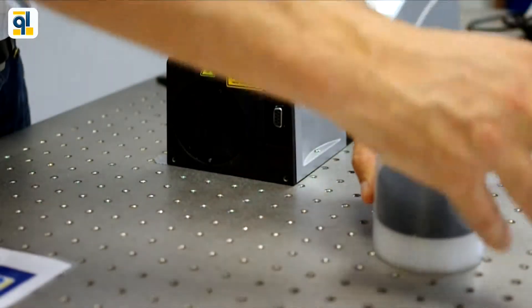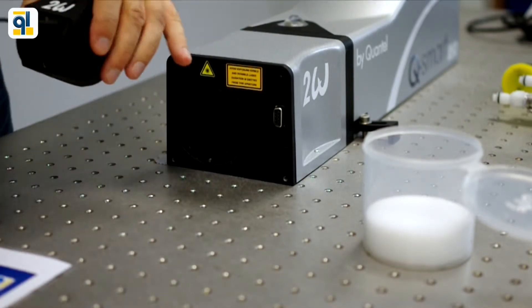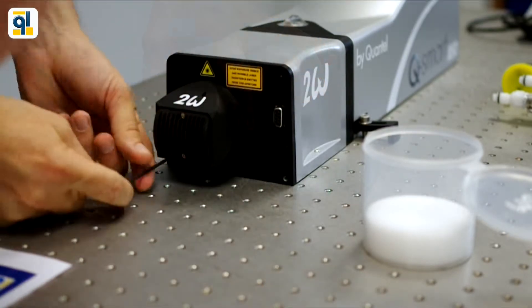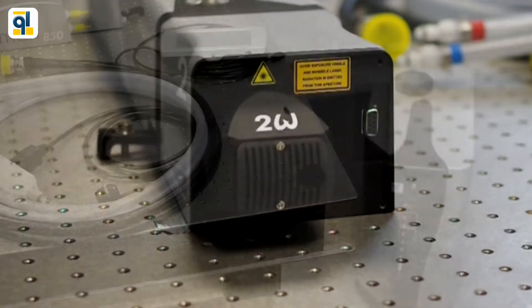The laser head comes with plug-and-play harmonic generators with no need for alignment. Each harmonic is supplied with its own dichroic module. Depending on your experiment, you may remove the beam dump from the dichroic module so that you can have access to the residual wavelengths.